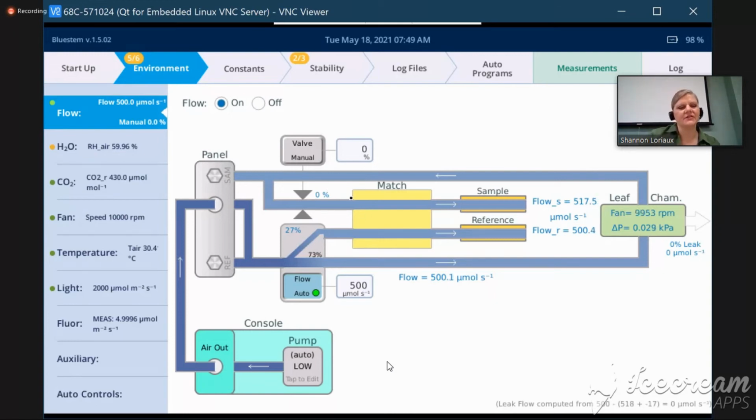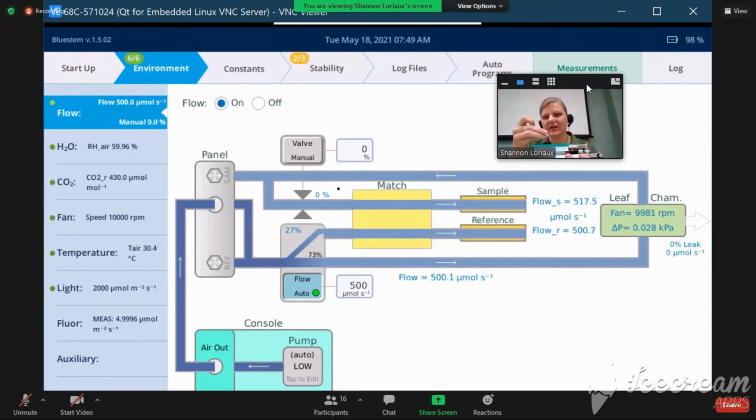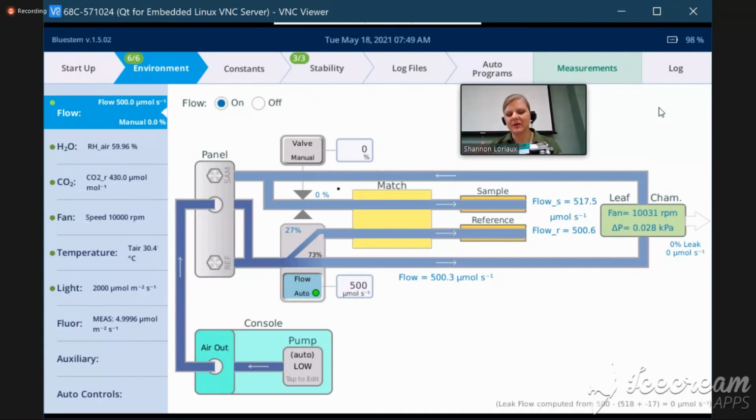So we have a chamber that is a whole plant chamber, and it's kind of a variant of this chamber, but basically it allows you to put an entire pot or container into the chamber, and you can basically measure a small plant with it. And in that situation, you have, oh, thank you, Elizabeth brought me the chamber example.